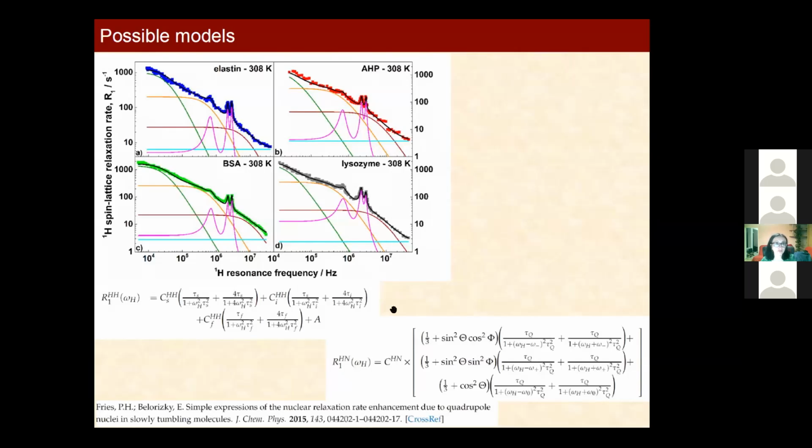However, I said, if you just decompose a function into, I don't know, a power series, Fourier transform, and so on, there's some information in that. So let us, not thinking much about what is behind, try to decompose the proton-proton contributions into 3 terms, which we just refer to as slow, intermediate, and fast. I mean, in terms of the correlation times, because there is dynamics associated with each term.